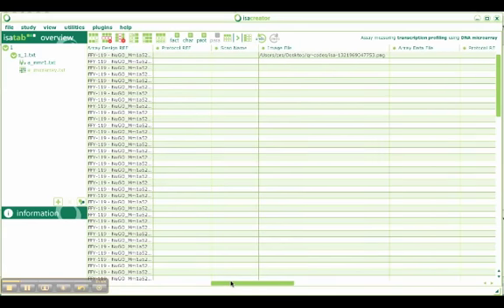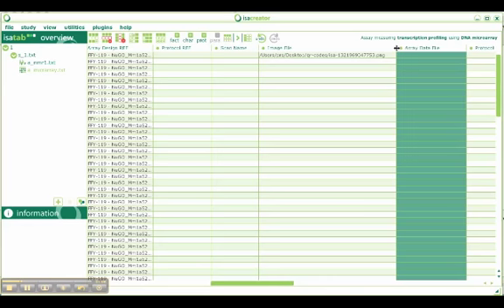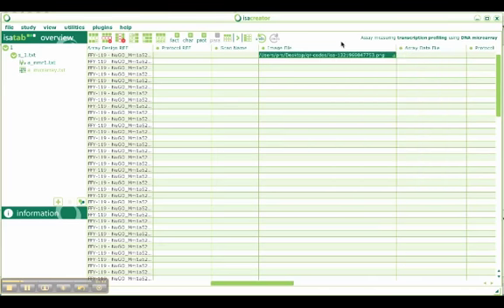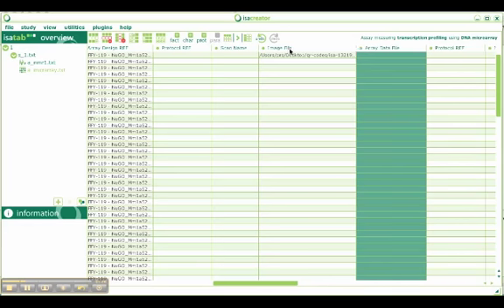This works at the moment only on your local drives. We hope to implement that in the future to be able to also access remote locations. And this feature is available for all the fields in ISA syntax format where you've got a file tag.